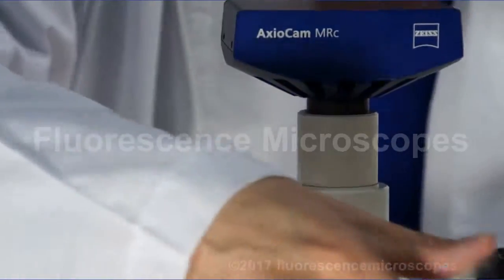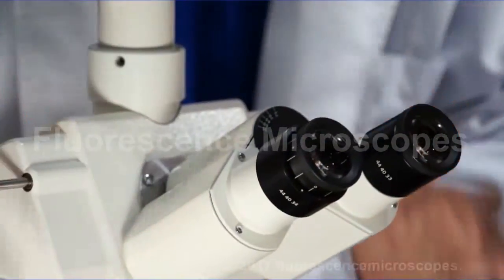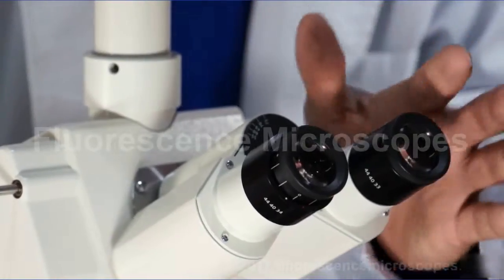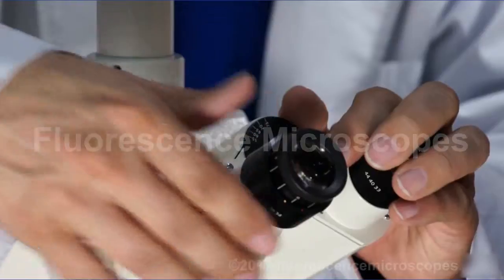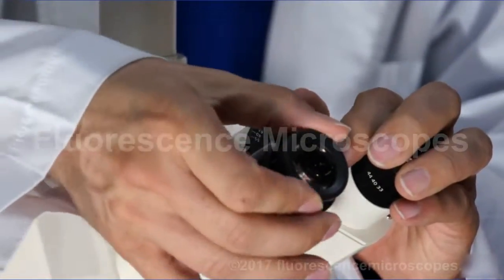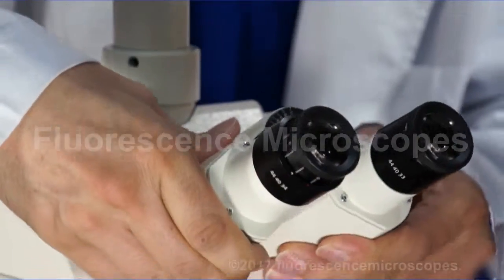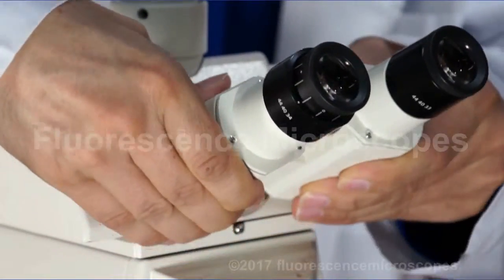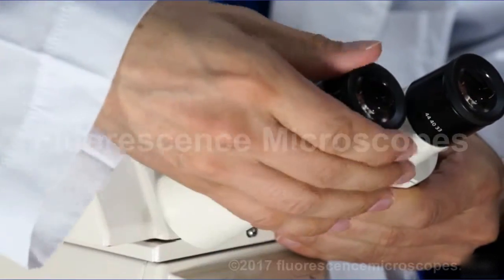It's got a diopter on one eyepiece. What you're going to want to do is focus using your focusing knobs, get one eye in focus, and then leave the focusing knobs alone and adjust this diopter so your other eye is in focus. It's also got an interpupillary distance, so you can adjust it for the distance between your eyes for your particular needs.